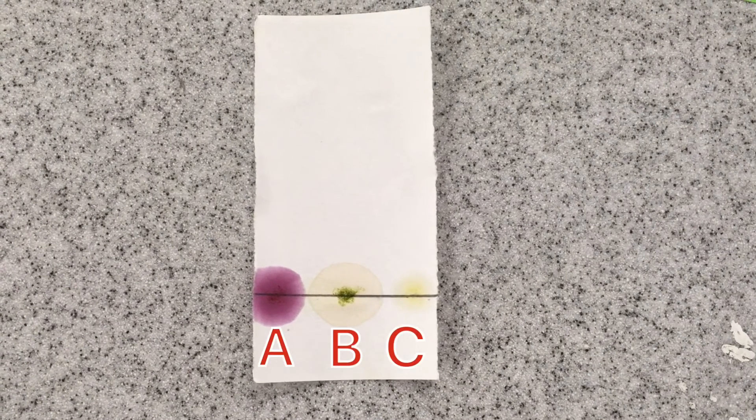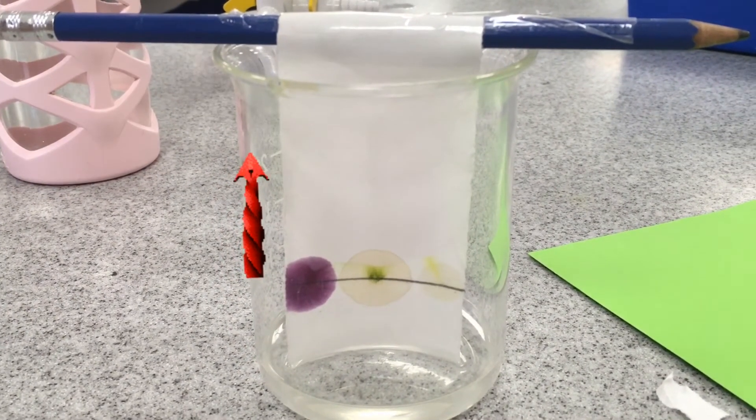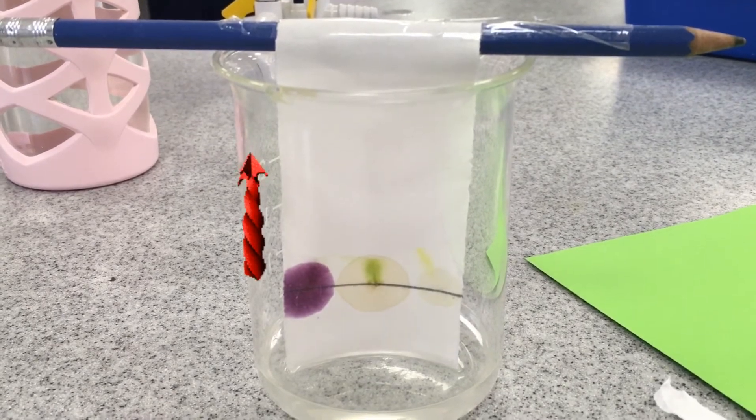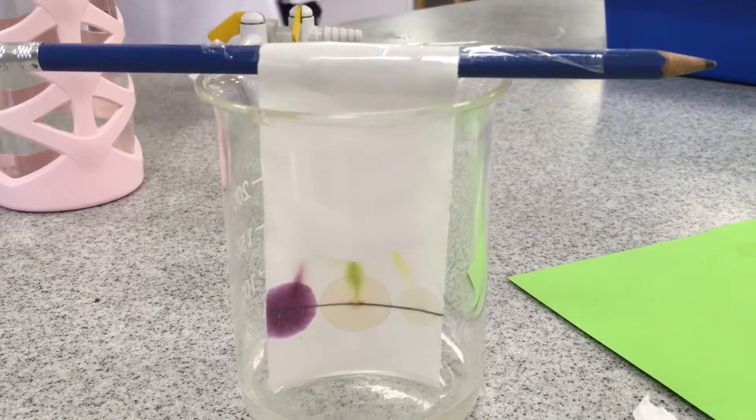Once dry, we will label the three substances A, B, and C. Then we will place the chromatography paper approximately on the surface of the propanone, which is 50 centimeters cubed. The solvent will travel up the paper carrying the pigment with it.